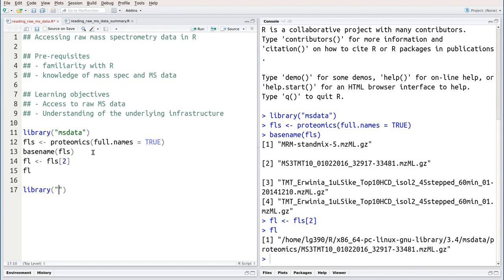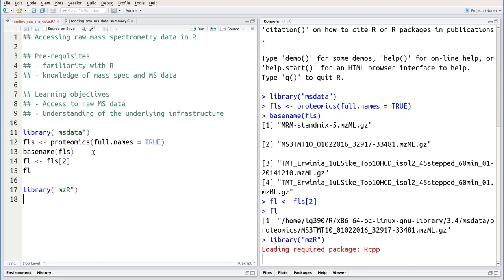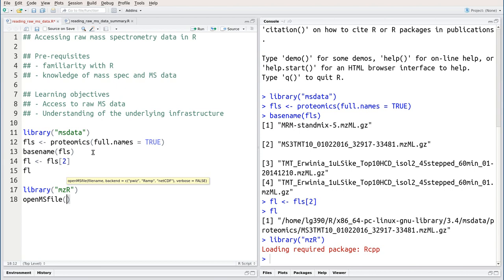The next package is mzr, which is a fundamental infrastructure for all work dealing with mass spectrometry in general and proteomics in particular. The function we're interested in today is OpenMS file that takes the full path to a file, a single file in this case, as input.